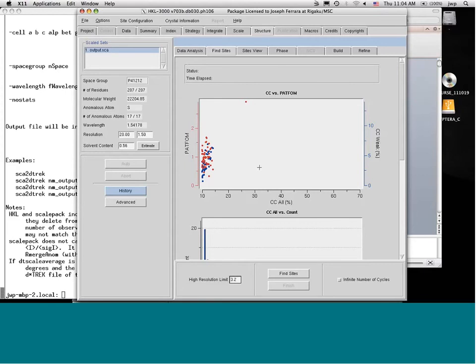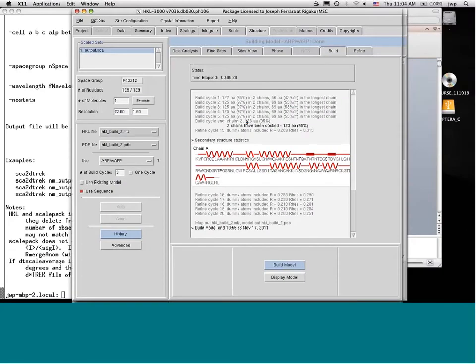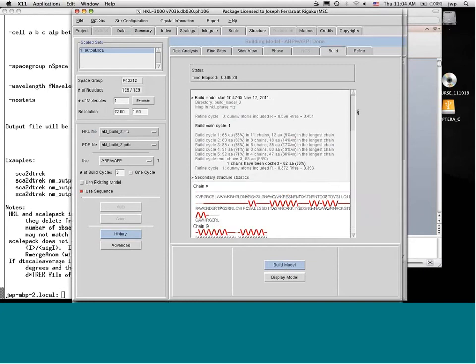Do you have a recommendation for data resolution for trying sulfur SAD? I would try it with anything. The main thing here is that it's so easy to put in a halide. I don't see why you don't try that as well. Tom Edwards from Emerald Biosys gave a nice webinar on that, and you should watch that and decide what to do with that. It's really pretty good. Yeah, had good success with that, and that one is recorded and it's on the website. So I agree, you should try that as well.